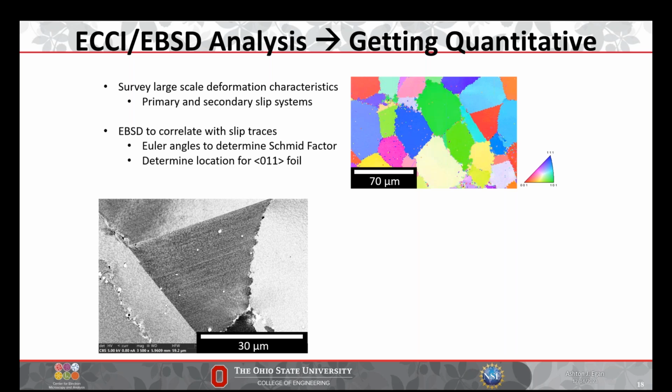But in practice, Dan and I have seen a bit better than that. Because it's such a diffraction technique, you can see these at both 5 kV and 20 kV, perfectly fine. Okay. And that doesn't affect the tilt and rotation of the actual software that we're using, right?